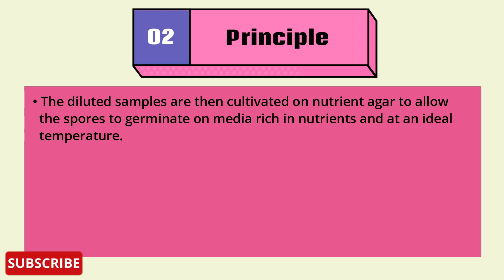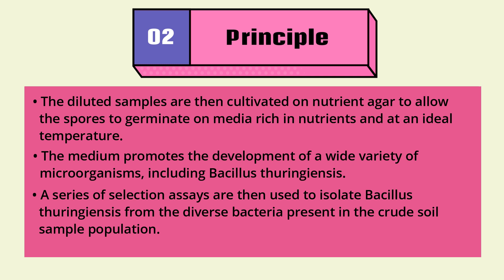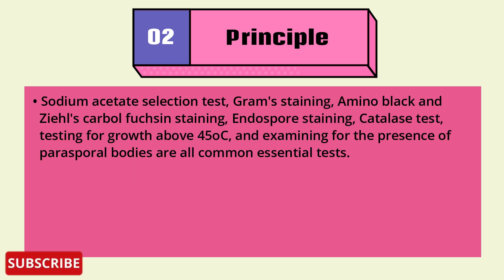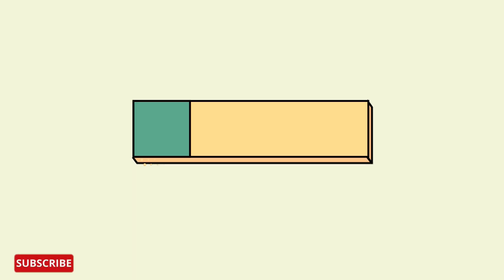The diluted samples are then cultivated on nutrient agar to allow spores to germinate on a medium rich in nutrients at an ideal temperature. The medium promotes the development of a wide variety of microorganisms including Bacillus thuringiensis. A series of assays are then used to isolate Bt from diverse bacteria in the crude soil sample population: sodium acetate selection test, Gram staining, amido black and Ziehl–Carbol fuchsin staining, endospore staining, catalase test, testing for growth above 45°C, and examining for the presence of parasporal bodies.